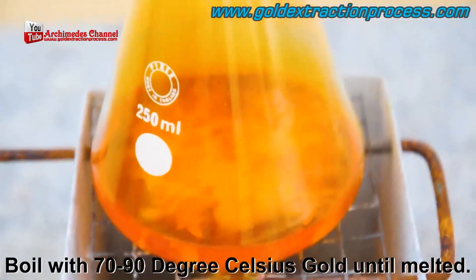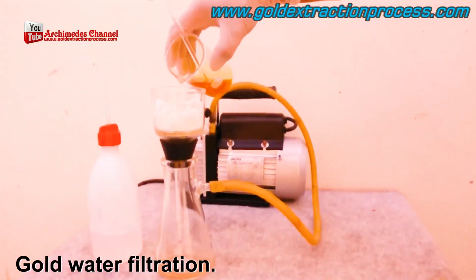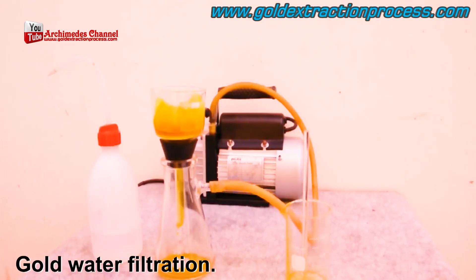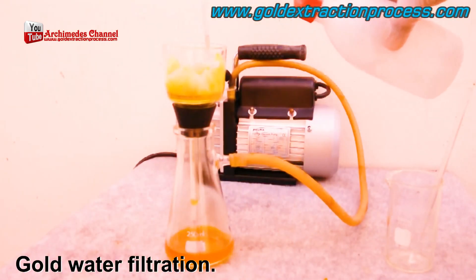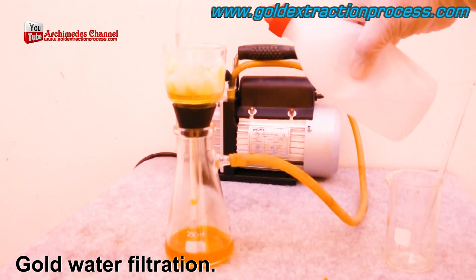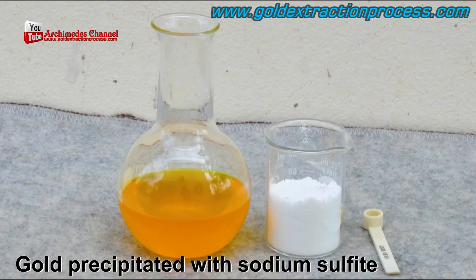The chemical reaction begins, and it's boiled at 70 to 90 degrees Celsius until the gold actually melts. It then needs to be filtered a few times, with more distilled water used to rinse the filter and the cup, to ensure all of that gold-water solution makes its way through.